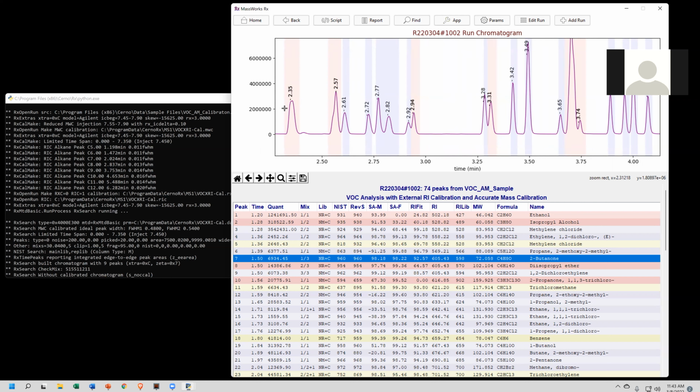And you can see here that we have marked areas. This is where we've co-added the spectra to obtain a spectrum for searching and for analyzing. And you'll see that the red bands indicate mixture bands, and you can see how many mixtures down here. And the blue bands mean that it just thinks it's a pure component. So for example, let's go look at this peak at 235. So I can just simply click at that.